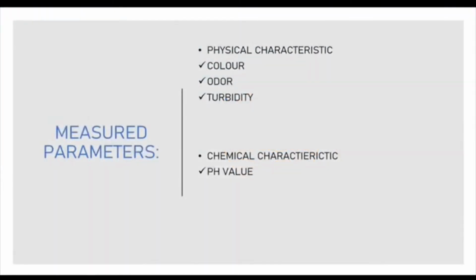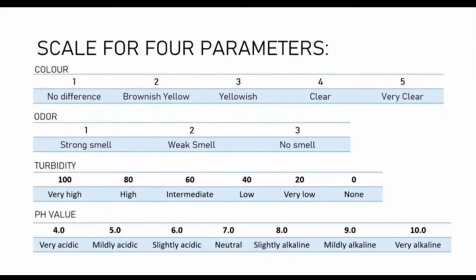We will be observing the physical and chemical characteristics of water, which comprise the color, smell, turbidity, and pH value. This is the reference scale for the 4 parameters that are going to be used in this testing.